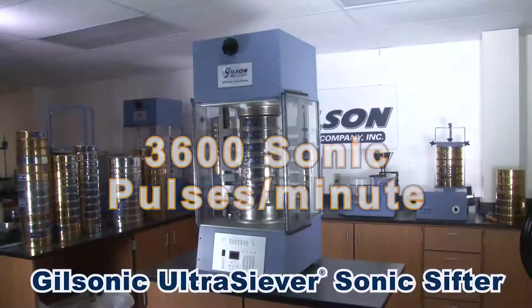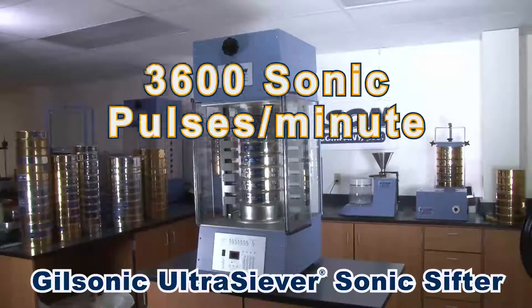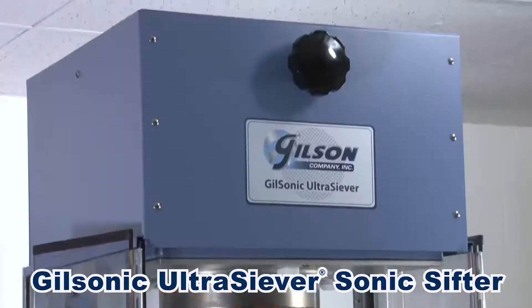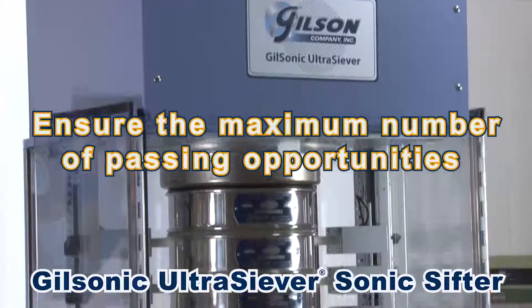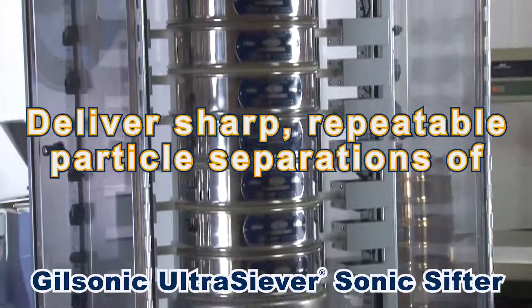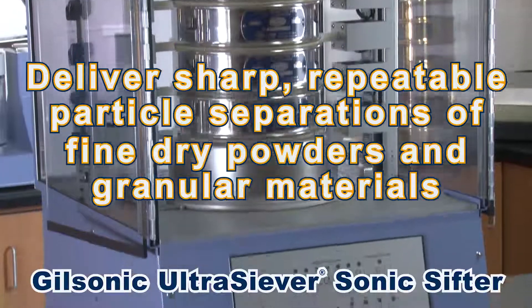With its 3600 sonic pulses per minute vertically oscillating air column and its innovative and programmable vertical and horizontal tapping actions, the Gilson Ultrasiever ensures the maximum number of passing opportunities to deliver sharp and repeatable particle separations of fine powders and granular materials.